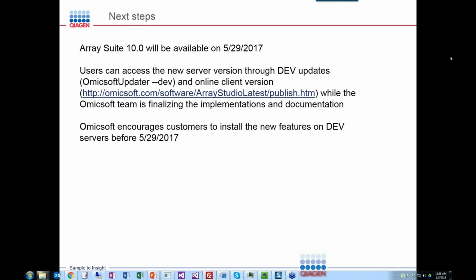There is a question on Sentieon for non-human genome analysis. I think Sentieon was optimized for human and mouse. For other species, because we don't really have those kinds of dbSNP-type known variant analyses, I don't think it's optimized, but GATK itself is still the gold standard. So whatever GATK provides, I think Sentieon will have that advantage.